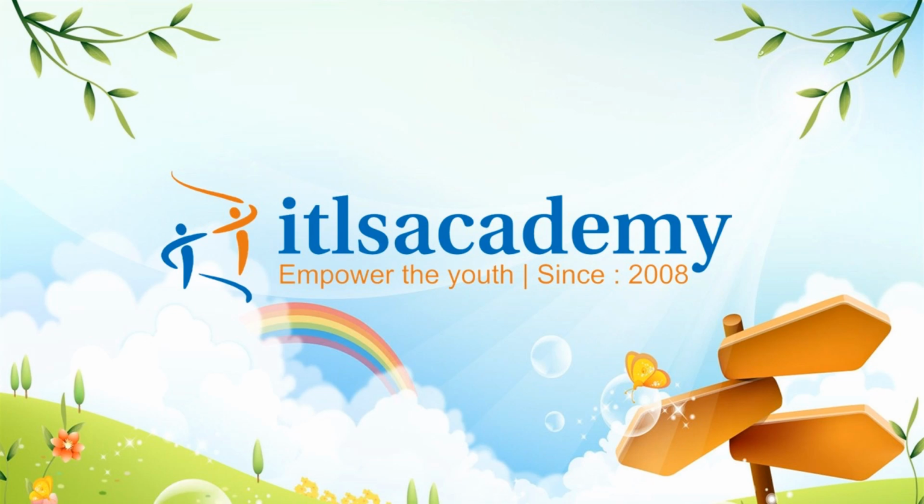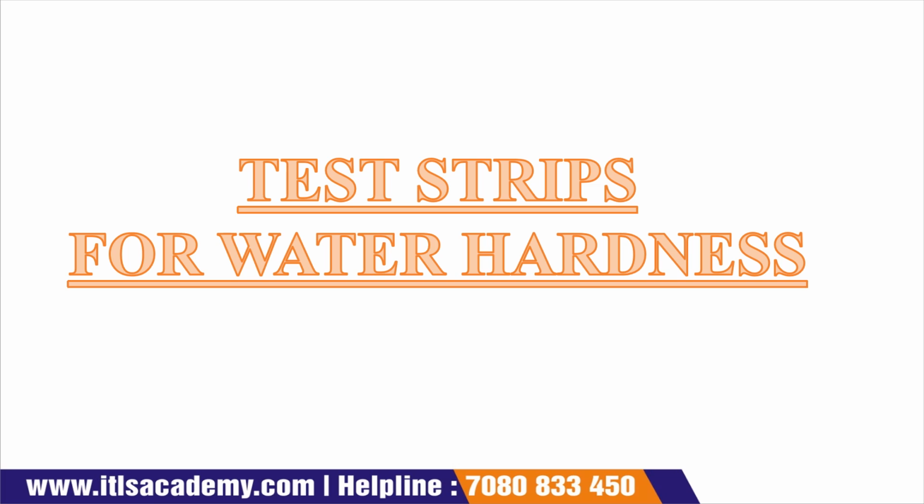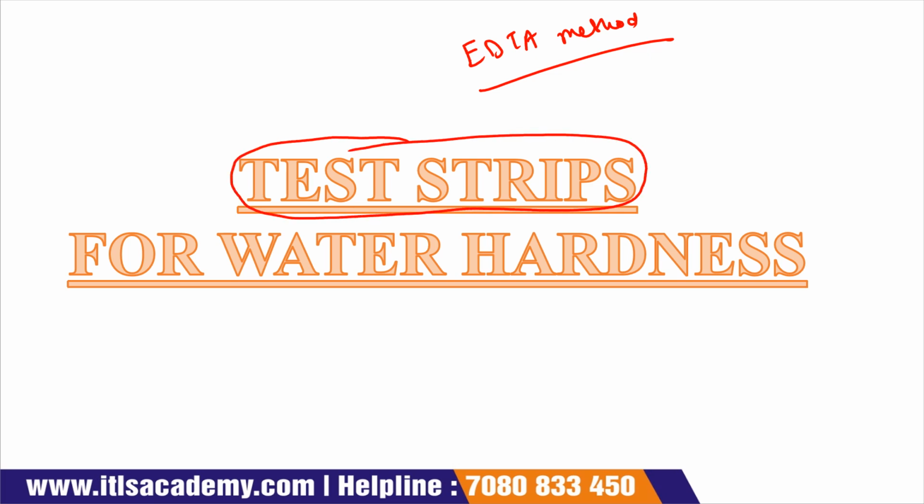Today we are going to discuss the determination of water hardness with the help of a test strip. In the previous lecture, we already discussed what the hardness of water is, and why we determine the hardness of water. The first method that we use for the determination of water hardness is the EDTA method. The video related to it is already uploaded in our account. Here, we are using test strips for the determination of water hardness.